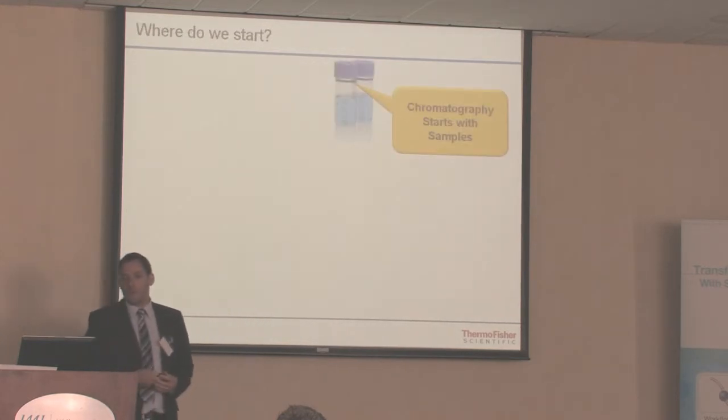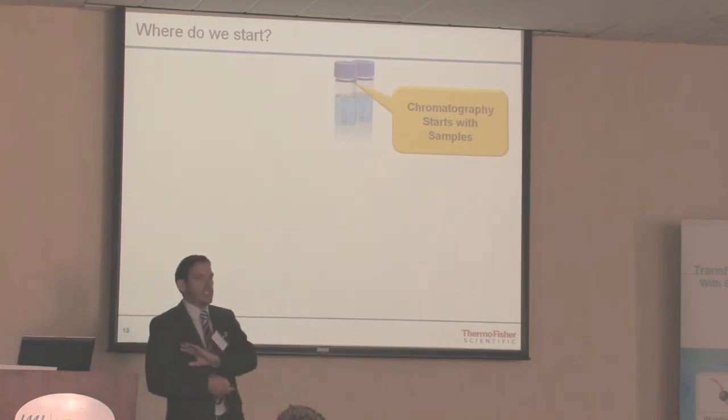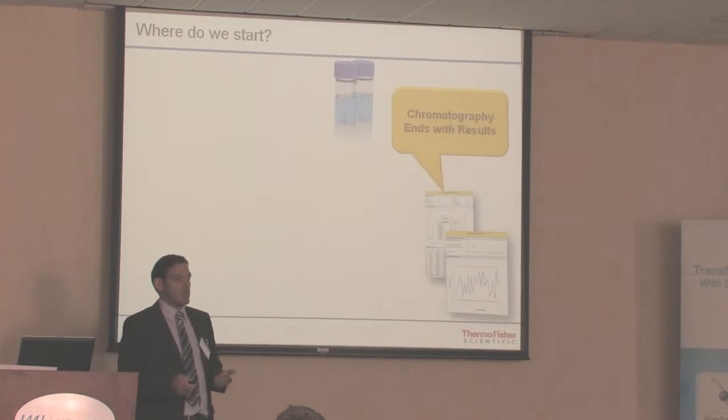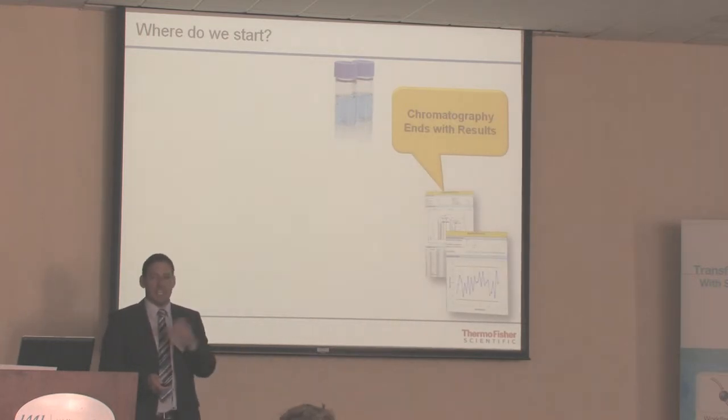So where do we start? Well, in chromatography, it all starts in exactly the same place with the samples, and it actually ends in exactly the same place as well with results. It doesn't matter what you're doing, you're going to start with a sample, you're going to end with a result.